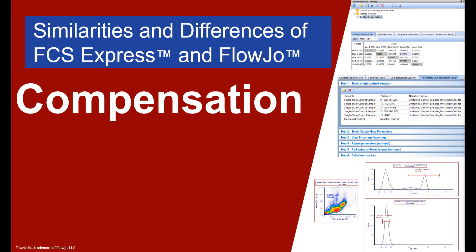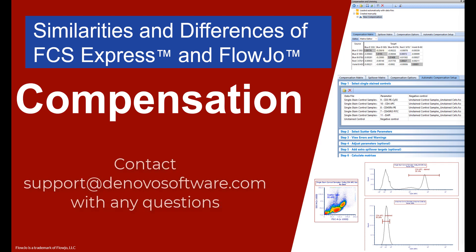As we saw, FlowJo and FCS Express share many similarities when it comes to compensation. You will need good controls for negative and single-stained samples. A wizard is used to perform compensation. Compensations are saved as a separate file and then applied to your data for final analysis.